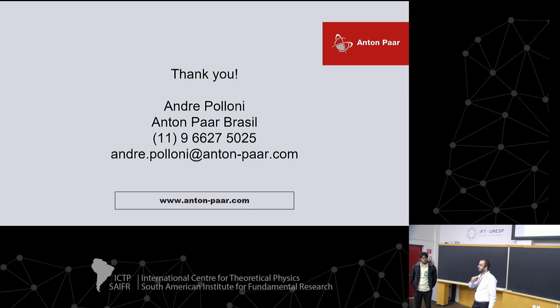The analysis of specific surface area done in these experiments was done at 60 degrees, if I'm not wrong, but we are working on analysis at environmental 25 degrees as well. So you don't need preparation at all.